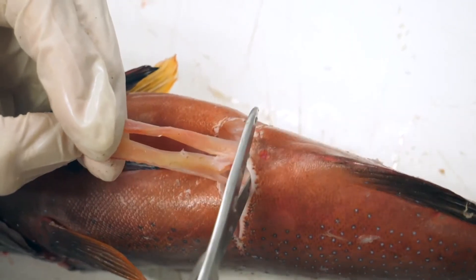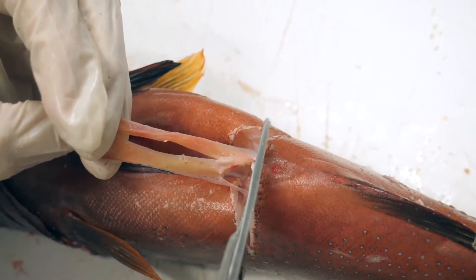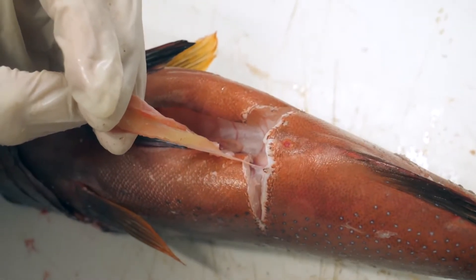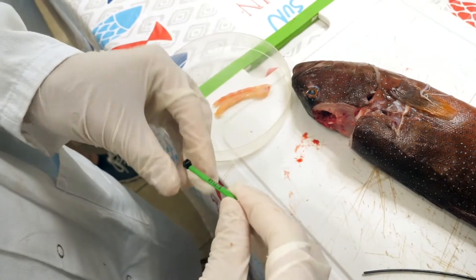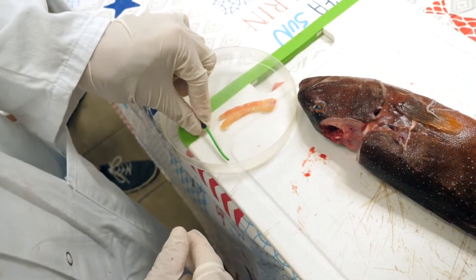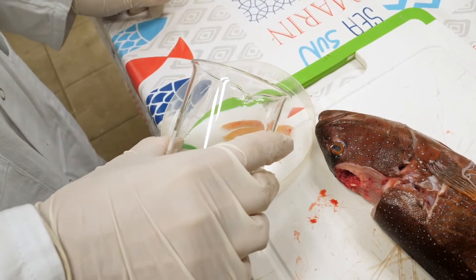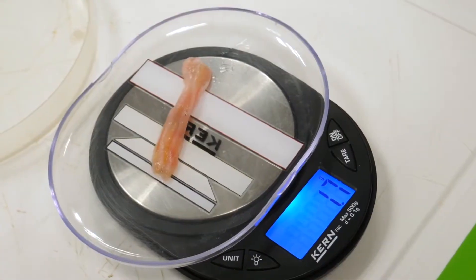When the gonads have been separated, use the scissors to make a cut as close to the anus as possible to extract them. The gonads are extracted! You may now place them in the container and add the identification tag. Be sure to add a little water so that the gonads do not dry up before weighing and observation.